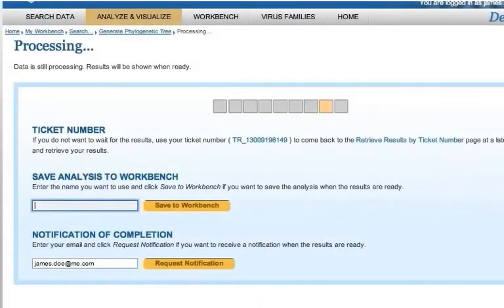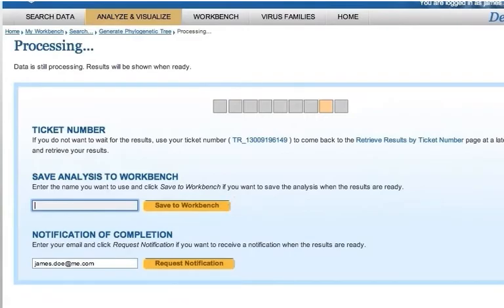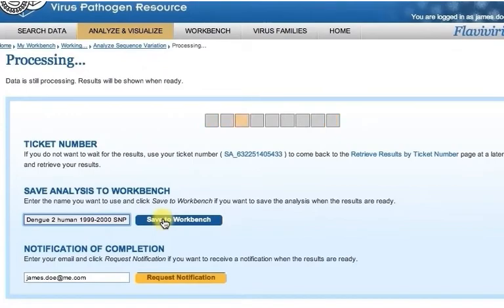While an analysis is running, you can choose to save it upon completion to your workbench and move to other parts of the site. To do so, enter a name for the analysis and then click Save to Workbench.